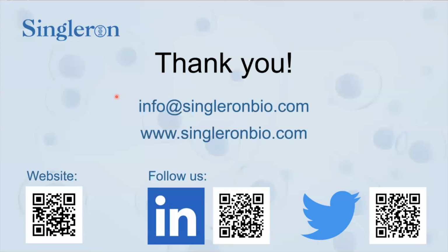On the other hand, if you're going for low throughput methods, then you want to sequence more deeply, and this is where more information can come. So if you choose low throughput methods, then I would recommend around 1 million reads per cell.